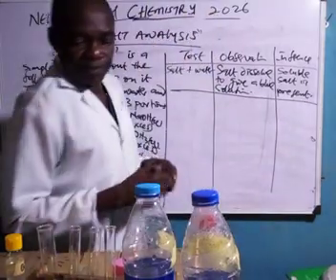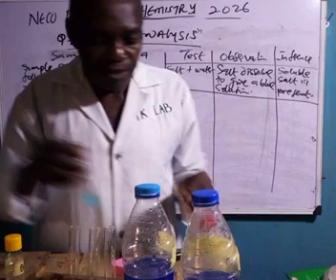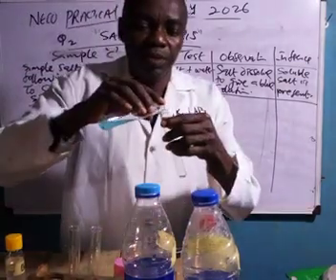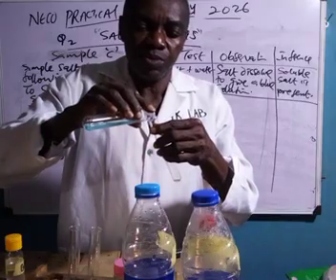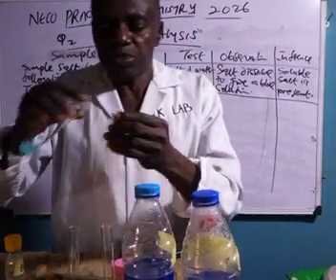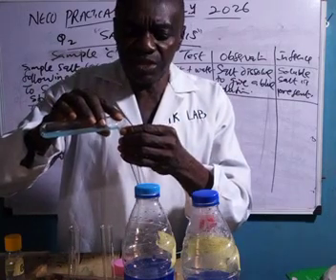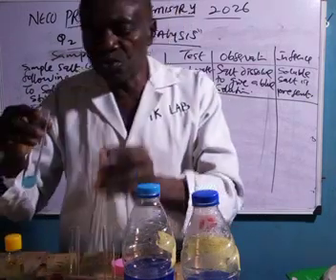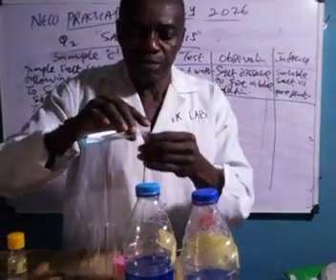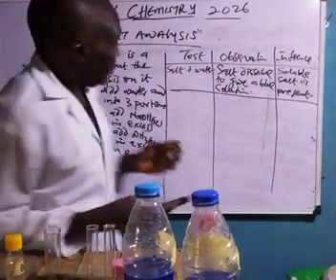Draw the line again. And we now share, so divide into 3 portions. Only 2 for now. I told you in my previous video, the smaller the better. But these things are already in my previous video, I just want to do it again. So you can see. Next question.